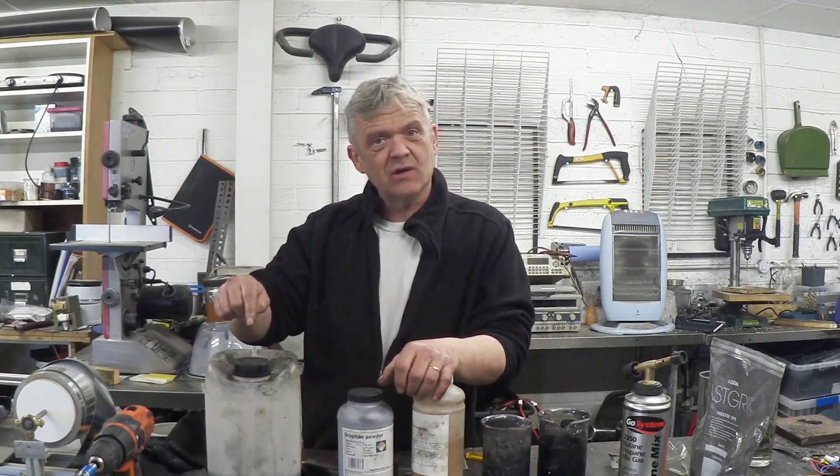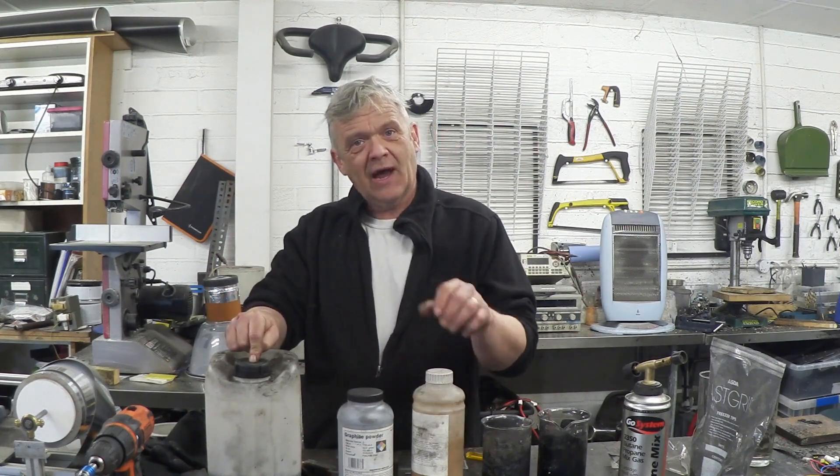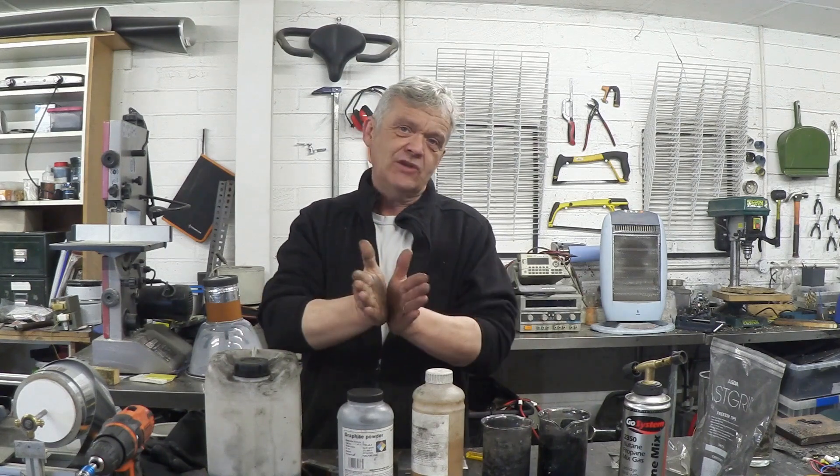Essentially, you chuck the graphite into the acid, add an oxidizer to open up the edges, and the acid will get sucked inside the graphite. That's pretty much all there is to it, so let's give that a go.